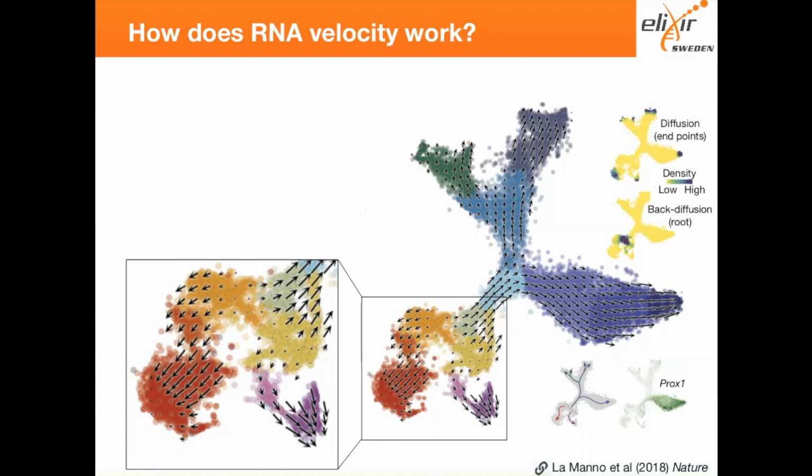You're saying that if you use pseudo aligners, you want to do exactly the same? With pseudo alignment, quasi mapping, you just quantify transcripts, but you have no idea where the reads actually map. So you can only do that with regular STAR alignment. Yeah. You need a BAM file actually to produce it.